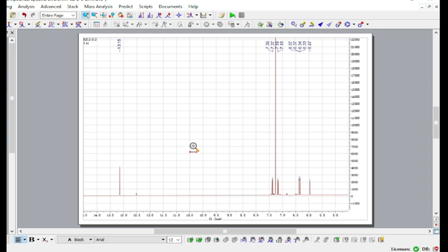So in my previous video, you asked a question that why I set the integration or the integrals to 1 or 2 or 3, or is there any thumb rule for that? So again, there is no thumb rule. You can start with any number and you will get a result. Now that result, are you comfortable with it or not?